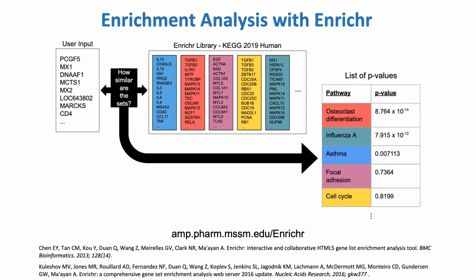determined to be enriched. The example shown here is actually using a real gene set and a real gene set library from Enrichr. The gene set used in this example and throughout the presentation is an upregulated COVID-19 signature from the human lung, which was extracted by my colleague Jesse. We will follow this gene set through all the Appyter demonstrations and explore how the visualizations are useful for analyzing the set.